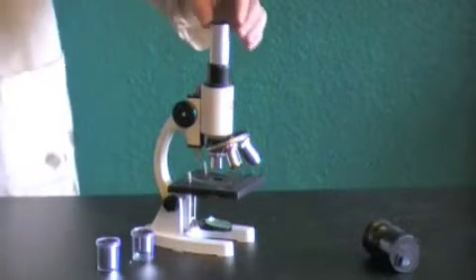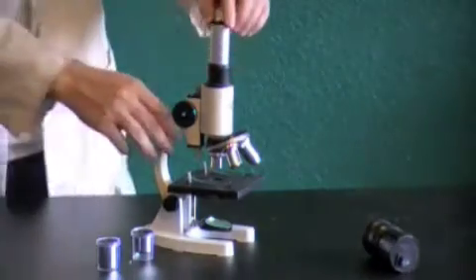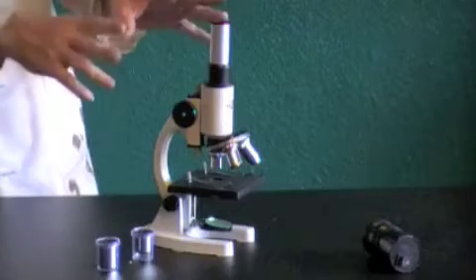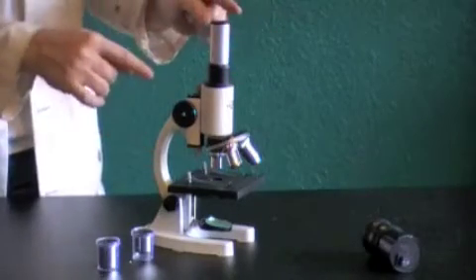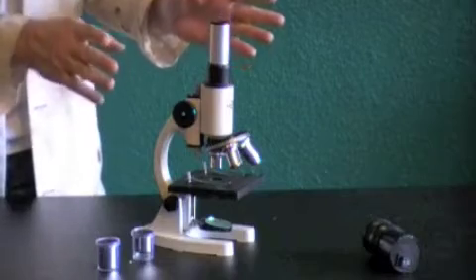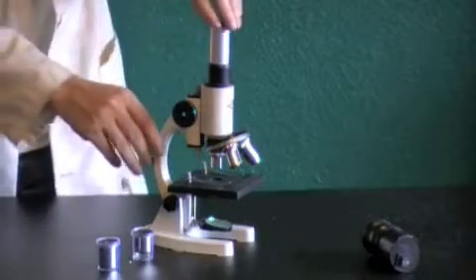The one at the top is called your ocular lens. You're going to take the cap off, and just to let you know, your microscope may not be exactly like this microscope, but it's going to be similar. It's going to have similar parts. So anything that we do with this microscope, you should be able to translate into your own.